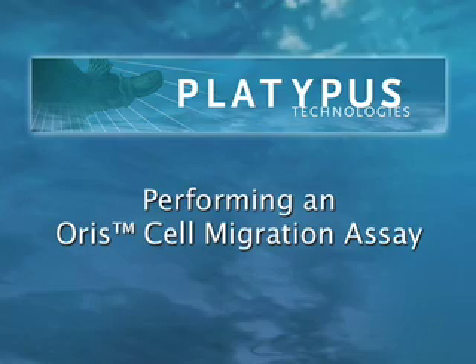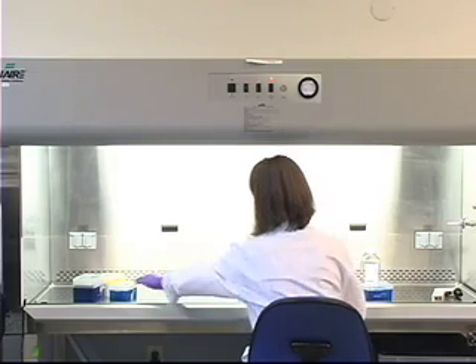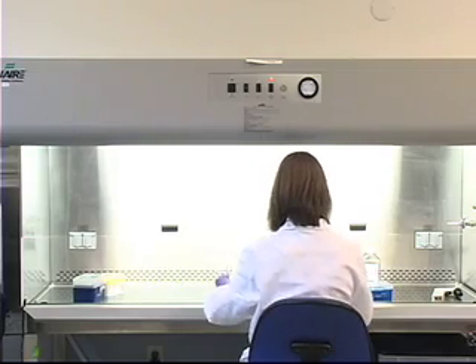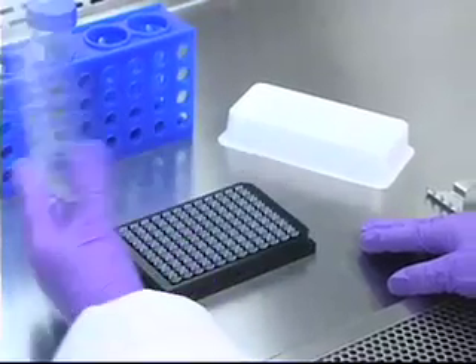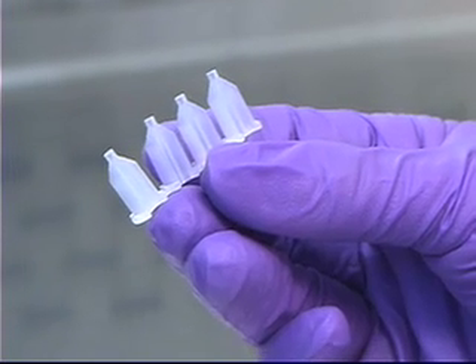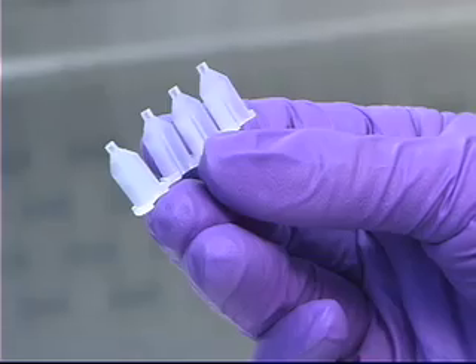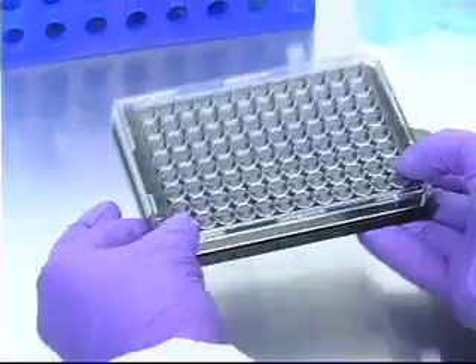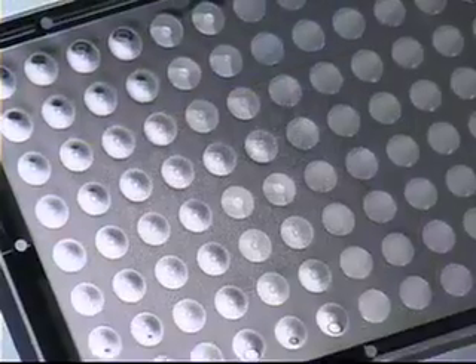Platypus Technologies has developed a unique method for performing cell migration assays without the use of transwell membrane inserts. This unique assay uses a 96-well plate populated with Oris cell seeding stoppers. The tips of these stoppers create exclusion zones in the well, and cells will adhere around the tips. When the stopper is removed from the well, the cells can then migrate into the center of the well.